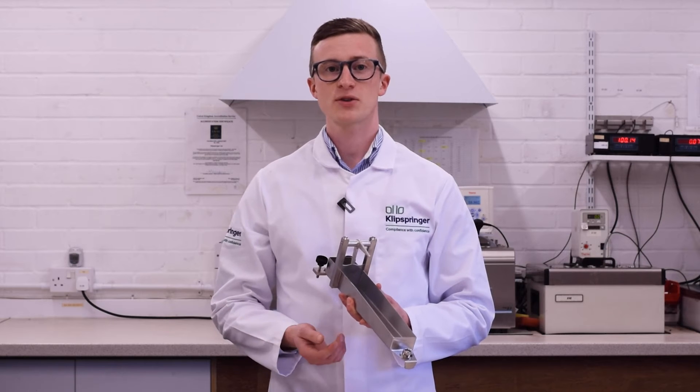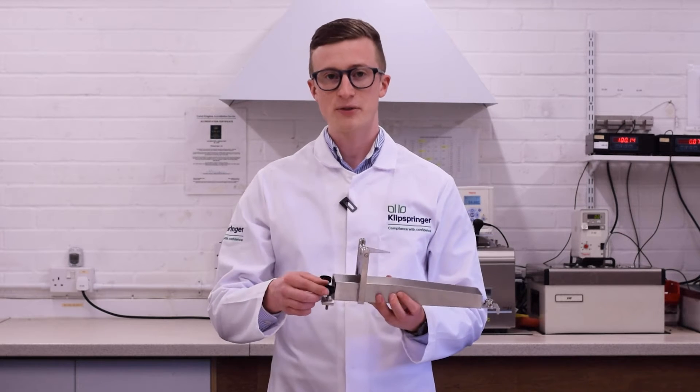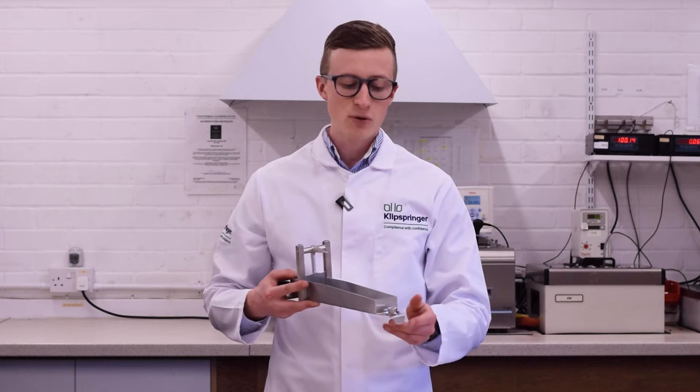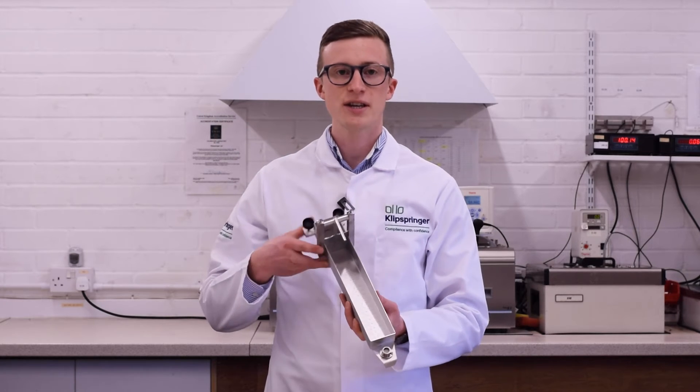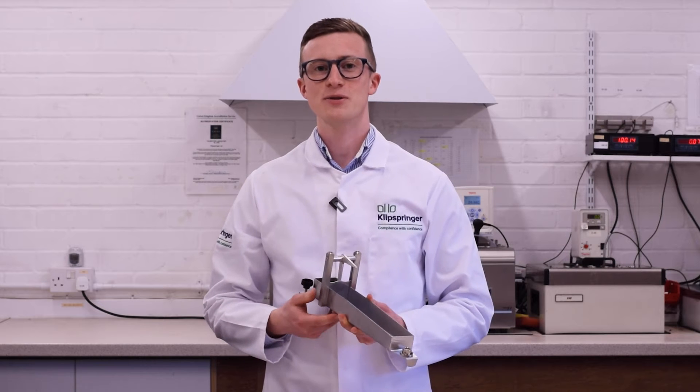Made from food safe 316 grade stainless steel, it has a sturdy design with adjustable levelling feet, a built-in level at the front and etched-in measurement lines, making it robust enough to withstand many years of use.